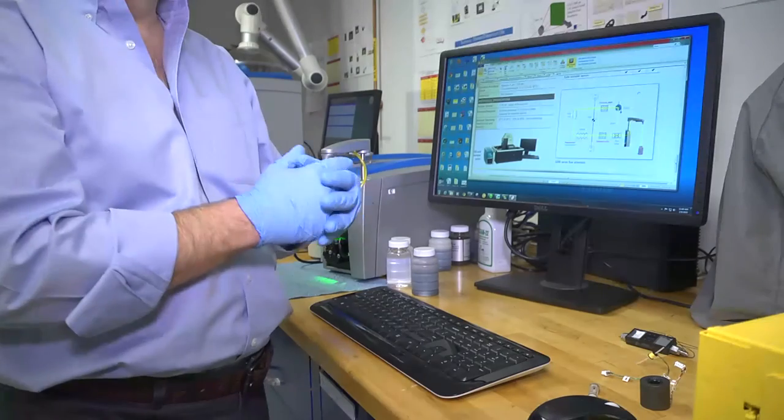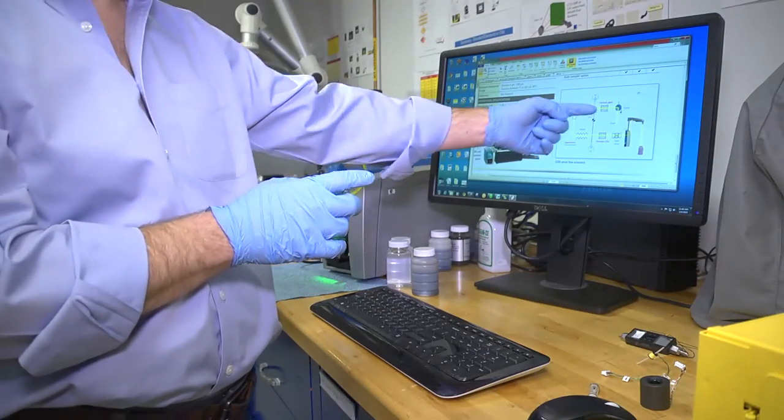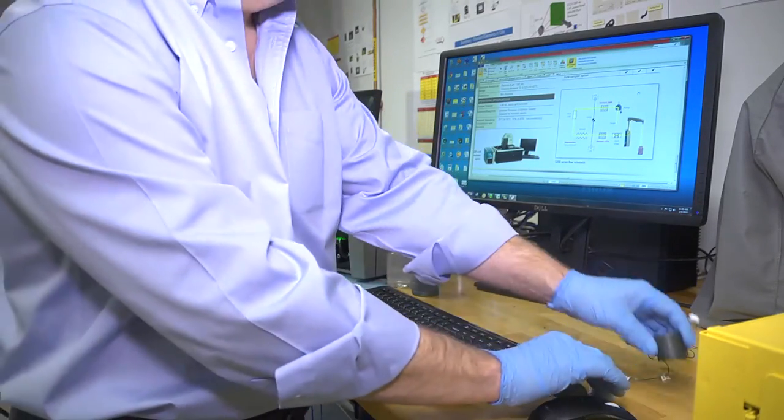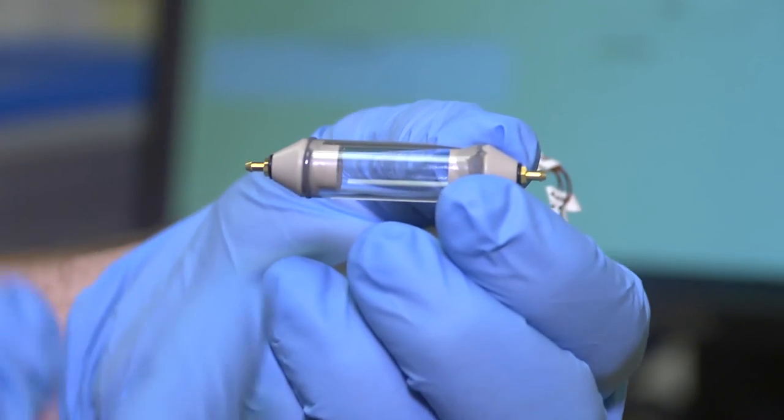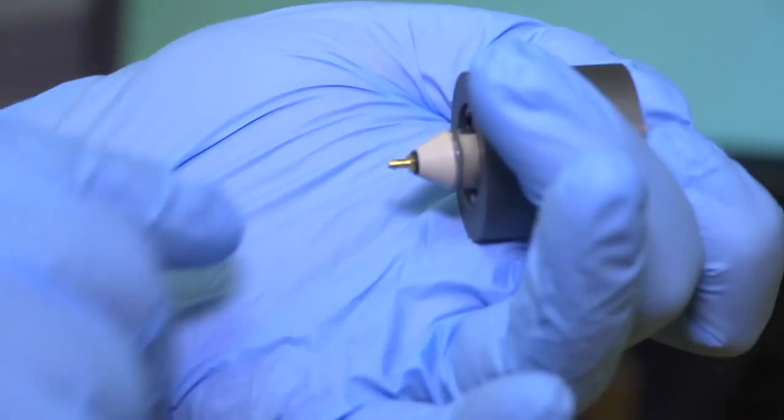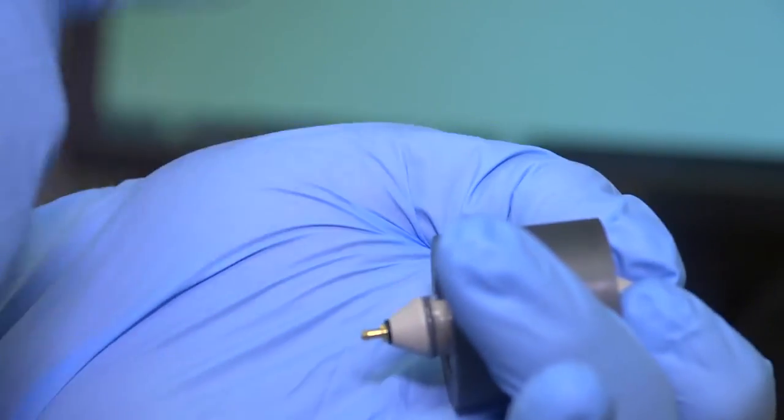Finally, as the solvent sample continues to flow, it passes into the larger magnetometer, where it fills roughly a 3 milliliter volume, and there the accumulated total ferrous is measured with this magnetometer.